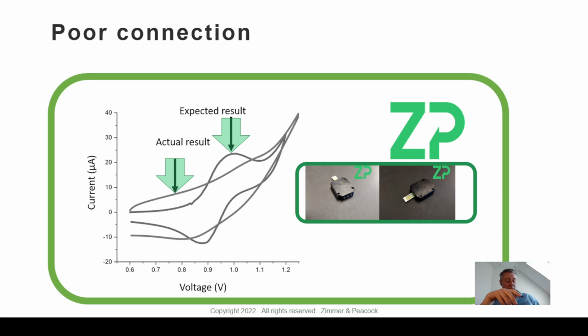This webinar is about, in the end, we brought it down to electroanalytical chemistry, but this is a lecture series that we give at workshops. We also give it at Swansea University as part of our duties at Zimmer and Peacock to lecture to the undergraduates in the chemistry department. We've covered the techniques of voltammetry. We've covered the technique of potentiometry, amperometry, and impedance spectroscopy.